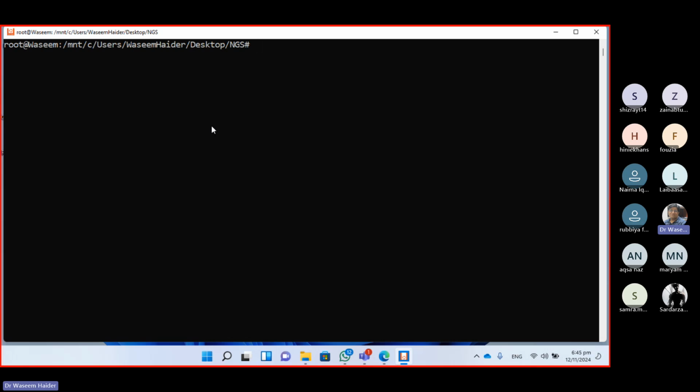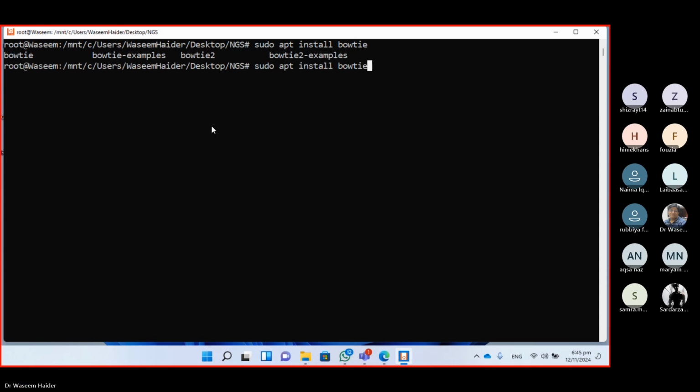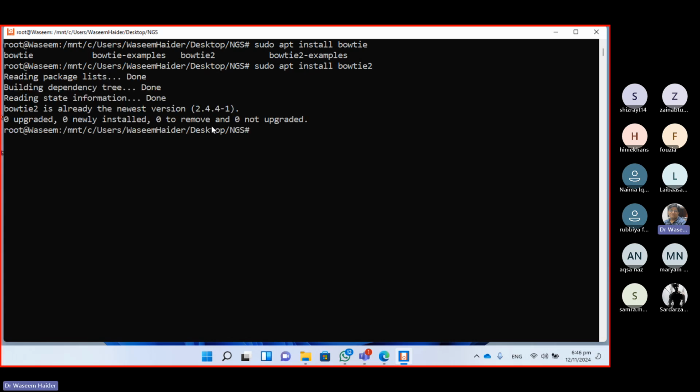All right, there is a tool called bowtie which we use here. Did I install bowtie? I think I did not, so I need to run sudo apt install bowtie2. It's a small tool and it will come real quick. He says it's already there. So there is simple bowtie as well as bowtie2. The latest one is bowtie2, and I think we were using bowtie2.